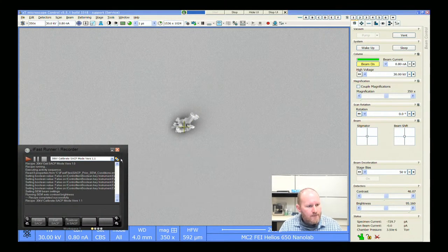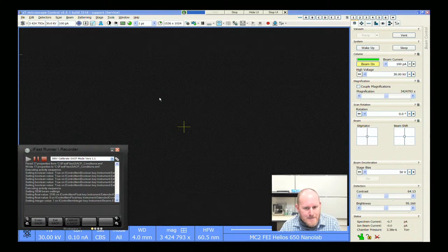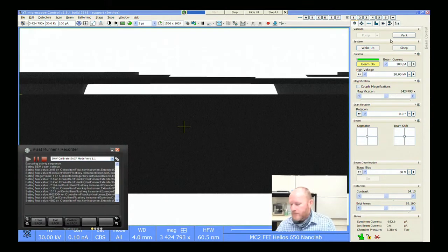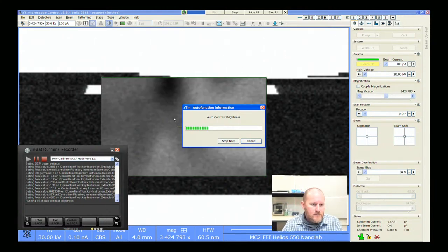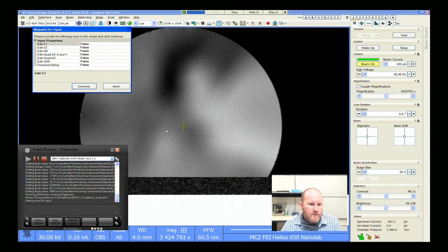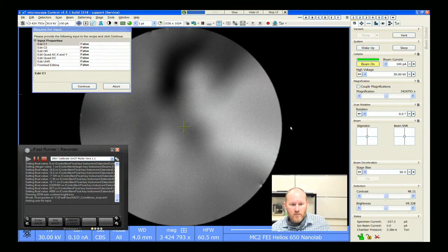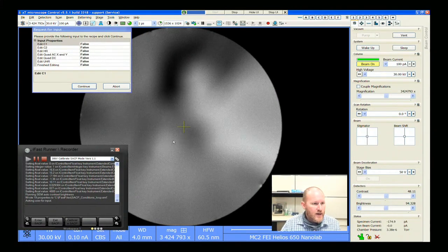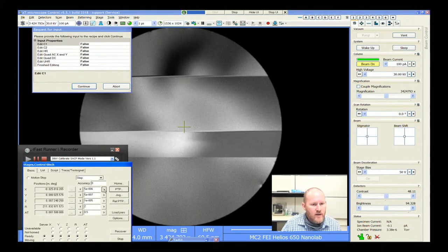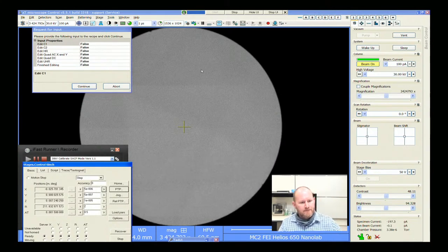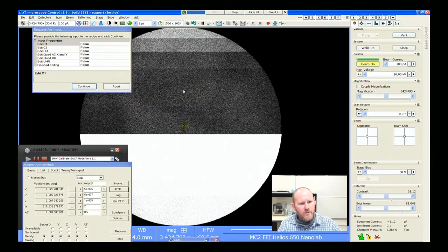So if we look at our calibrate SACP mode script — our default calibration values weren't too bad, but we made some small changes. So let's say the quad values: continue with 16.8, 15.2. It's pretty good, I'm just going to continue. Finished there, finished editing.